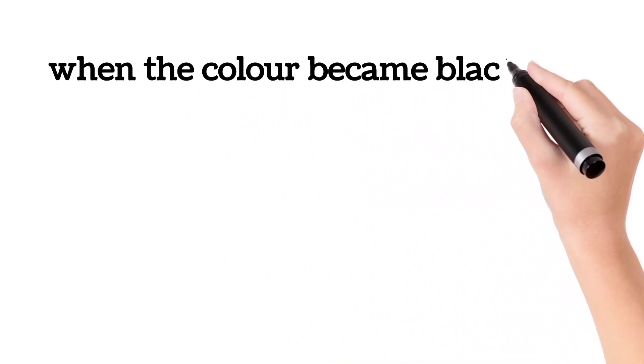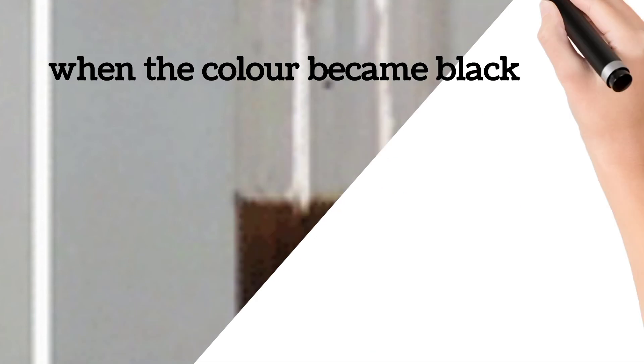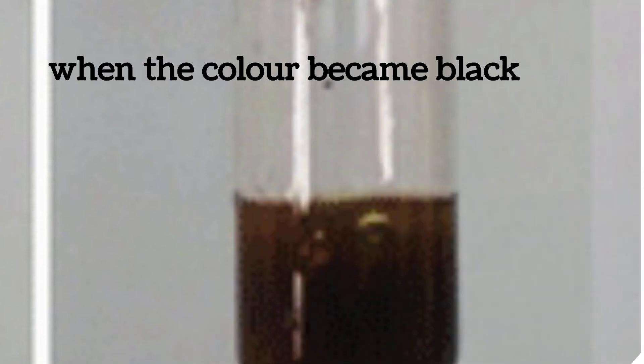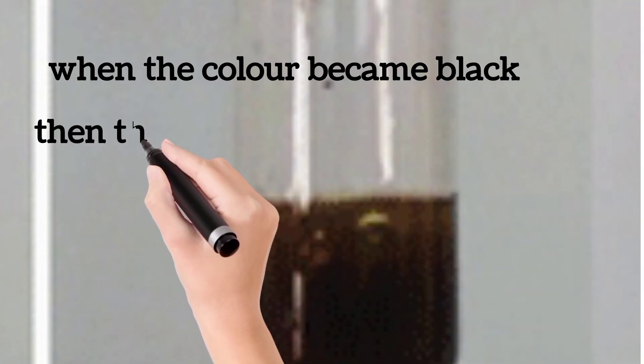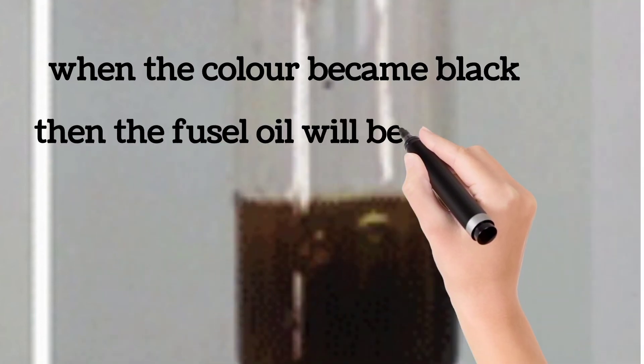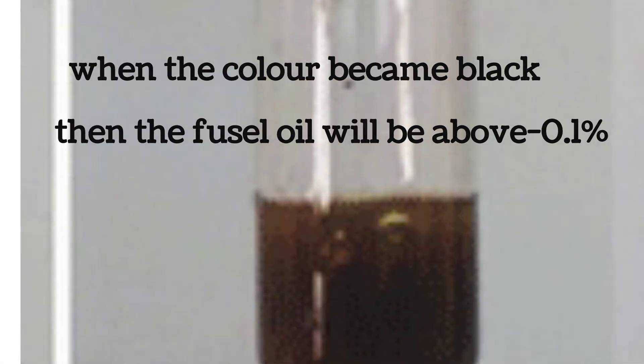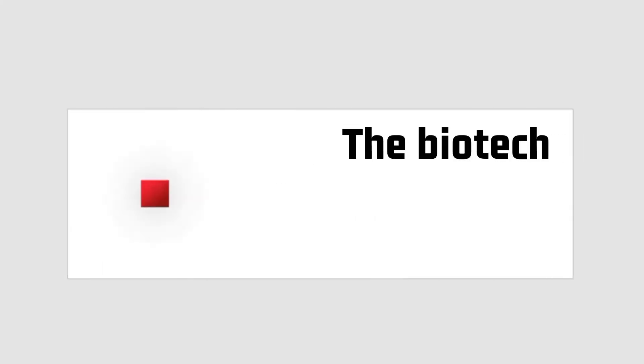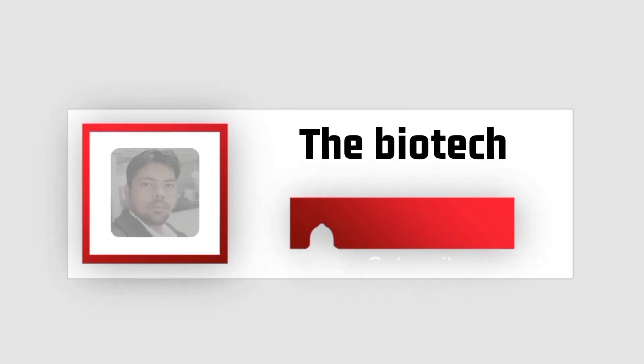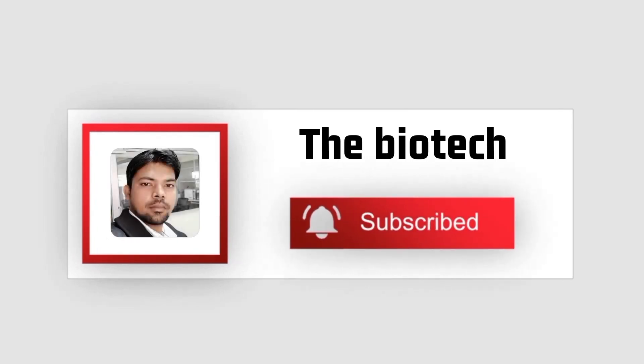When the color became black, then the Fusel Oil will be above 0.01%.